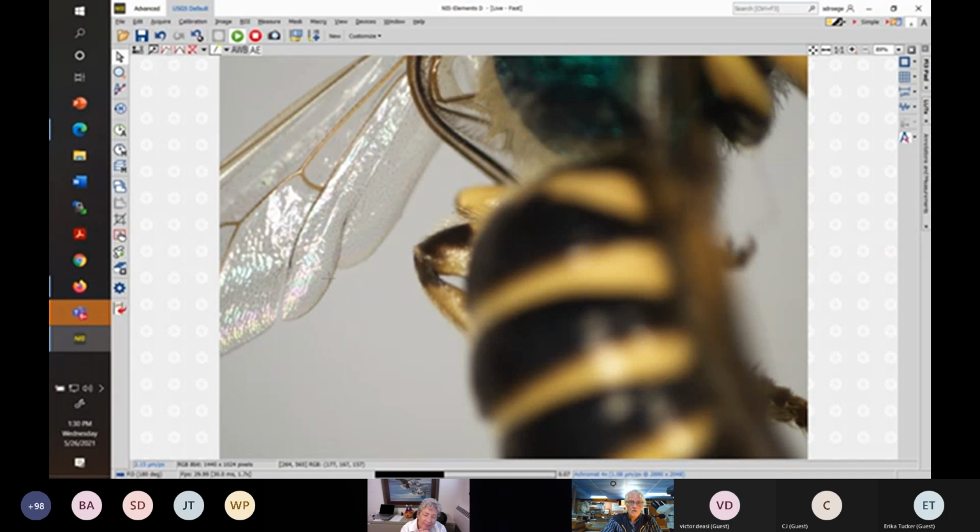So this ratio of the length of the vanal lobe to the length of the jugal lobe separates out big chunks of bees often. Here's the problem: the hind wing often gets stuck to the forewing, gets stuck to the side of the abdomen, gets twisted and bent and messed up because of how you processed it. This vanal lobe often will fold along its little foldy line.